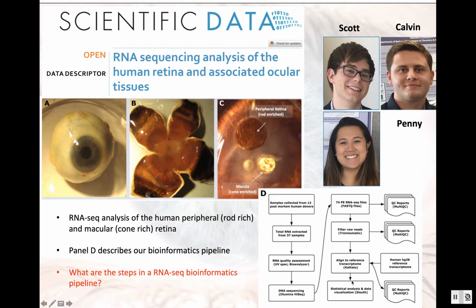Hello, this is Ray Enke from James Madison University, and today I'm going to show you a quick little video overview of how to set up the FastQC application in CyVerse Discovery Environment.